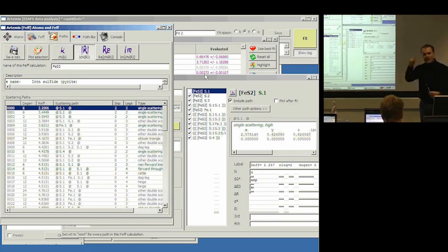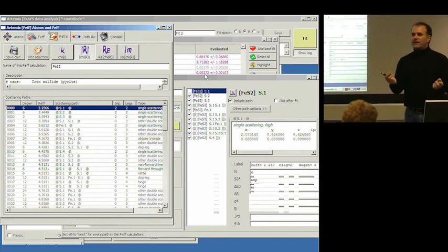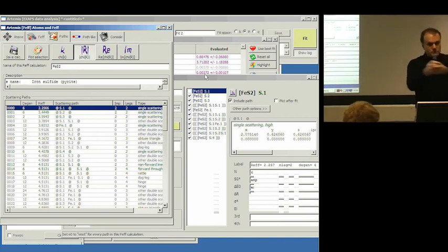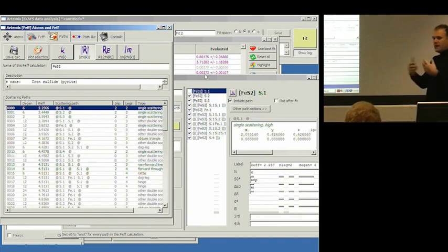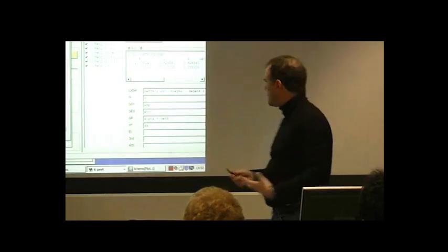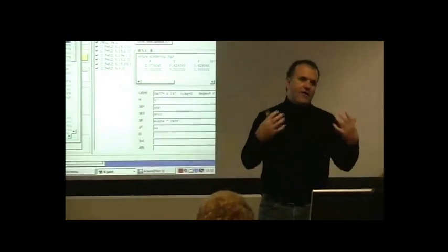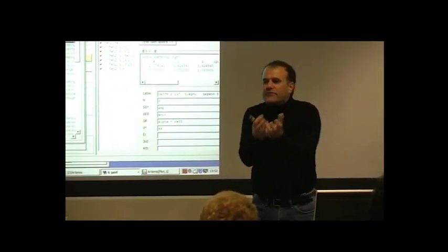In that example that I showed you yesterday, where Scott Calvin fitted 3 edges and all kinds of anti-site disorder and all kinds of oxygen vacancies and the effect of nanoparticle truncation effects, the reason he was able to put so much information into the fit and extract so much information from the data is because we can write down these interesting math expressions that describe the physics, the real science of what's going on in the problem.